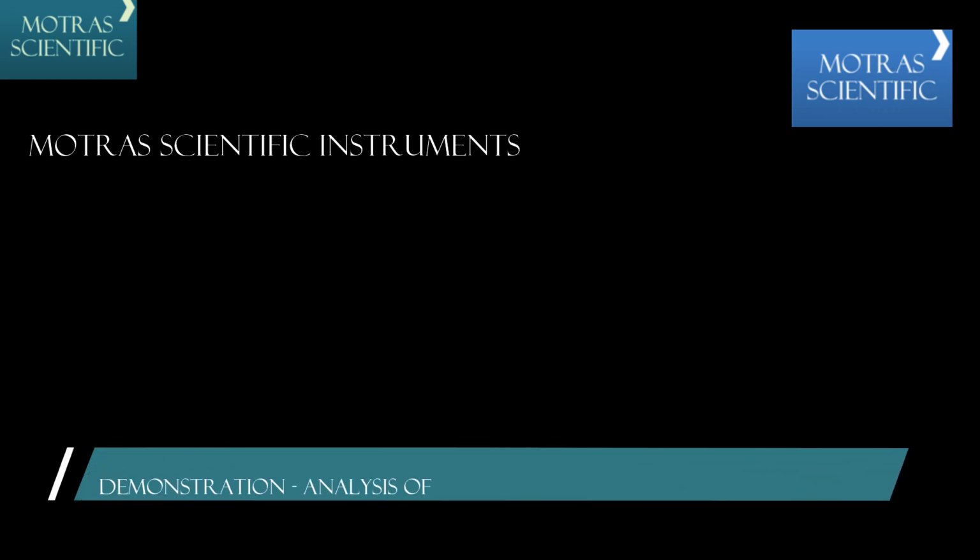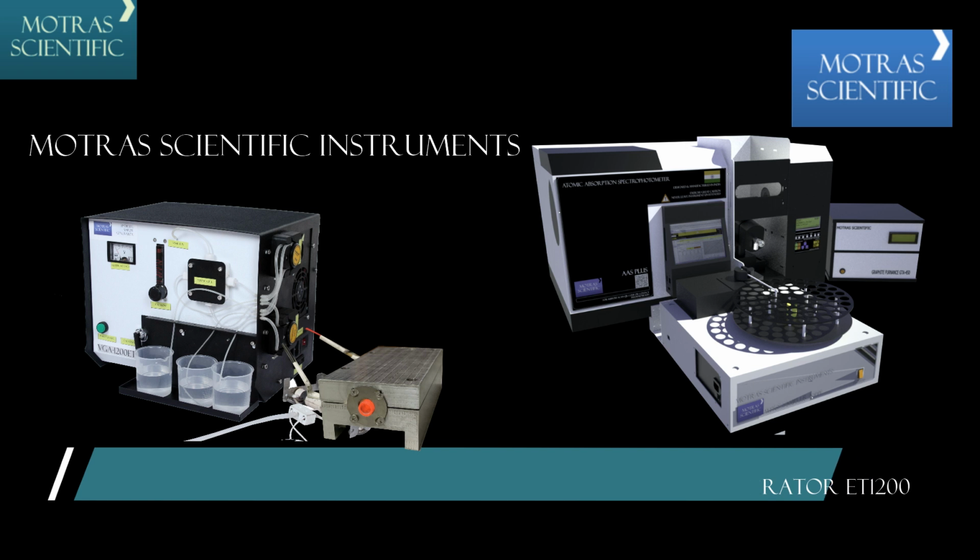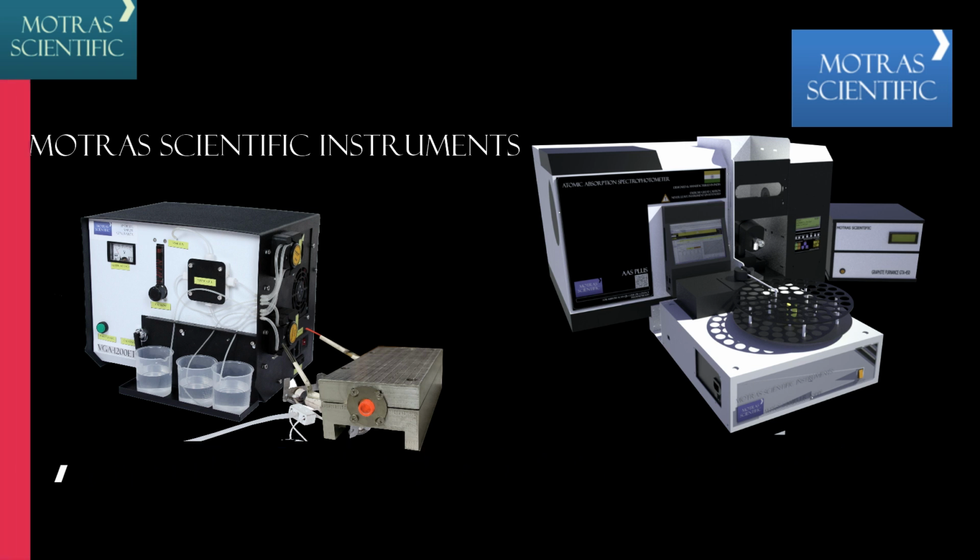In this video, we will look at the analysis of arsenic using our Atomic Absorption Spectrophotometer, AAS+. The analysis will be carried out using hydride generation technique. The Hydride Generator is our in-house developed model 1200 ET. This model uses ElectroThermal method to heat the hydride cell, which enables very high stability of the results.